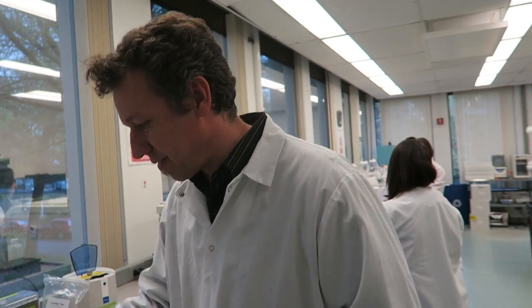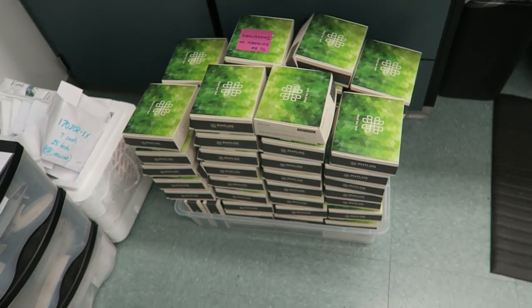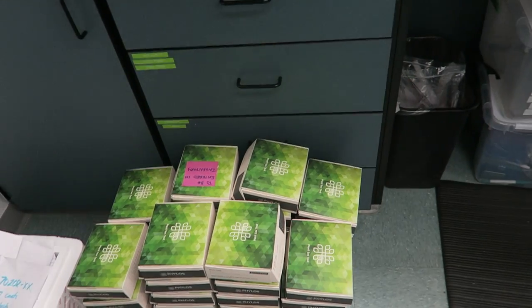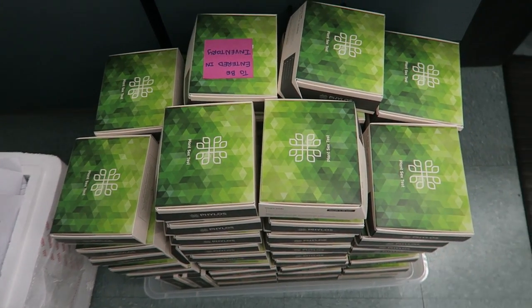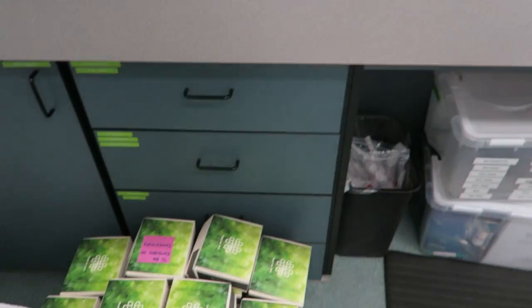We extract the DNA and it runs through our laboratory pipeline. It's extracted and then it goes into our cloud pipeline and gets processed and it gets placed on the galaxy. Oh wow, that sounds pretty cool. Let's go through each step of that. Look at this — I see you've got a few of these tests here. This is the plant sex test. We've got a bunch of other genotype kits. The colorful one is the genotype kit — that's the one with the red on it. And this is the sex test. These ones are a hundred-sample plant sex test.